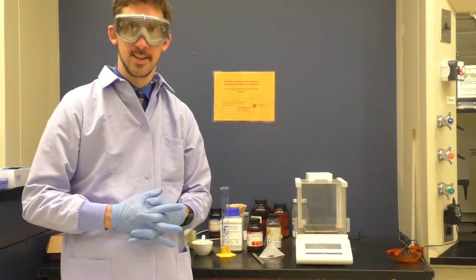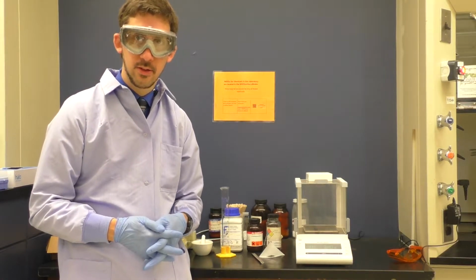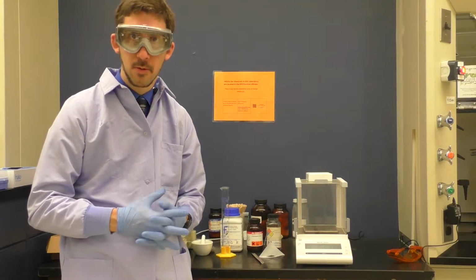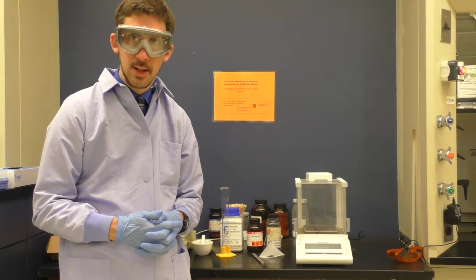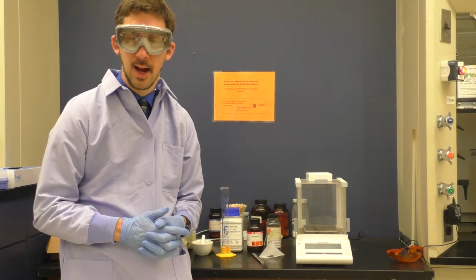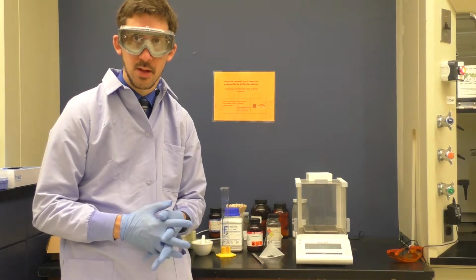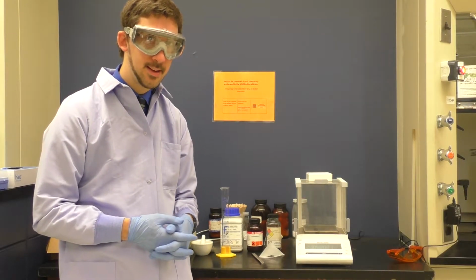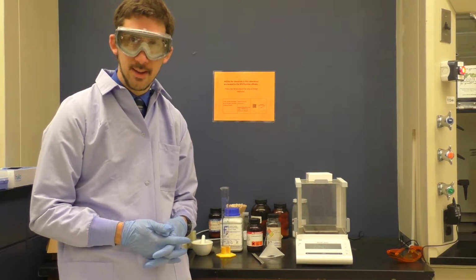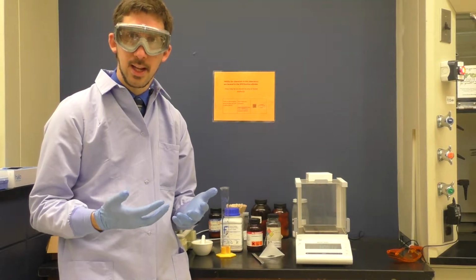Here we are in lab, ready to set up the synthesis of Tylenol. Now, we're going to start the synthesis using 4-aminophenol, also known as p-aminophenol or para-aminophenol. And we want to take that and acetylate it using acetic anhydride to produce the desired Tylenol, or acetaminophen. The problem is that if I look at my p-aminophenol, it's not a nice white solid like you would expect for an organic chemical.